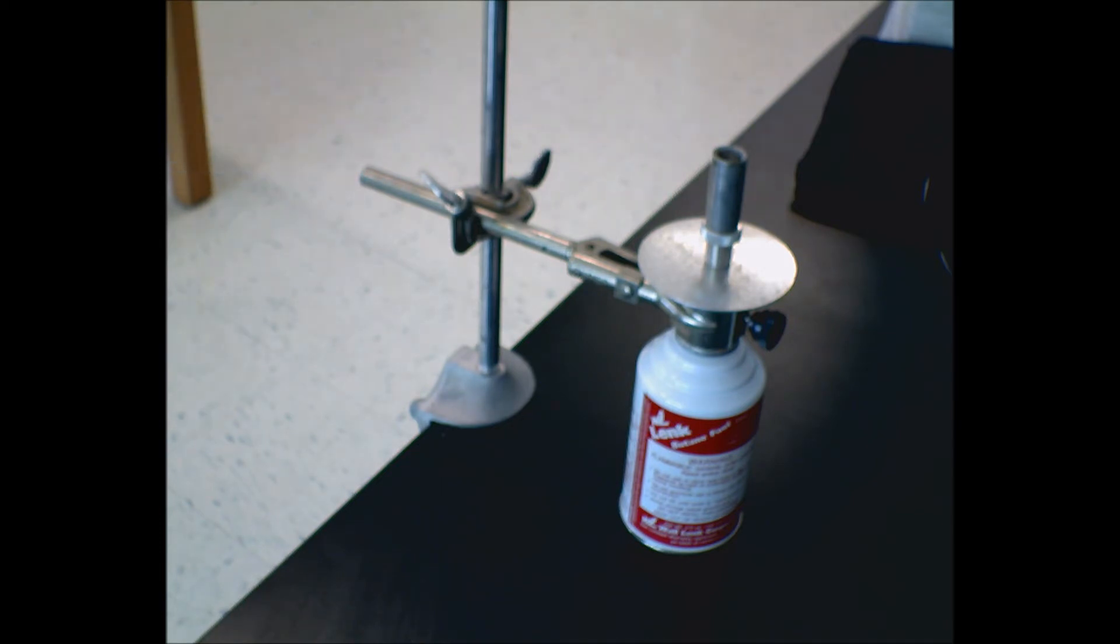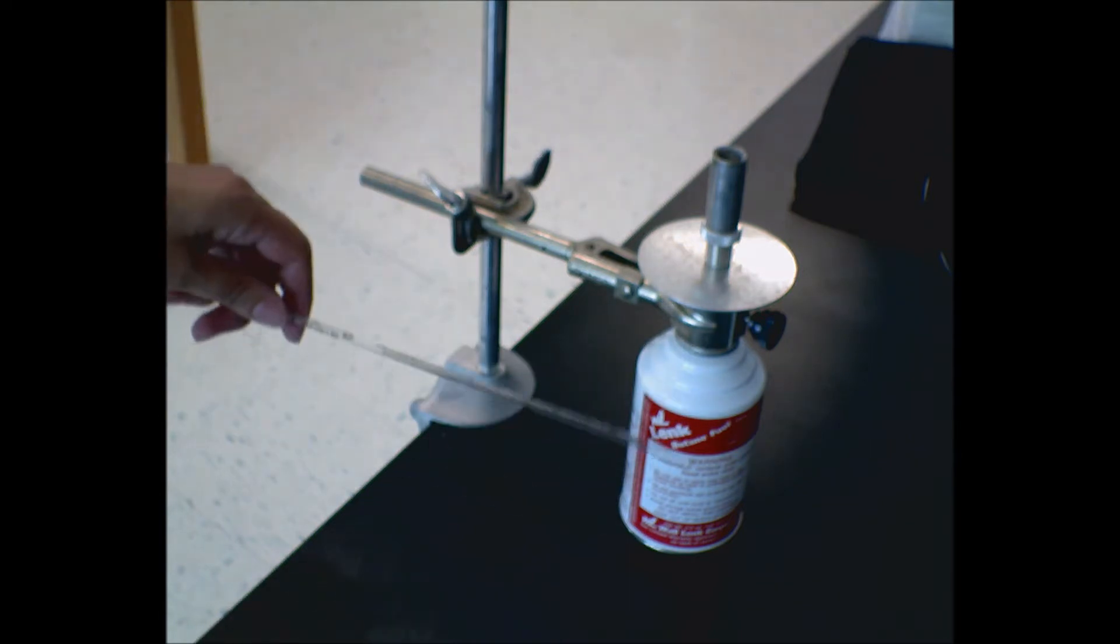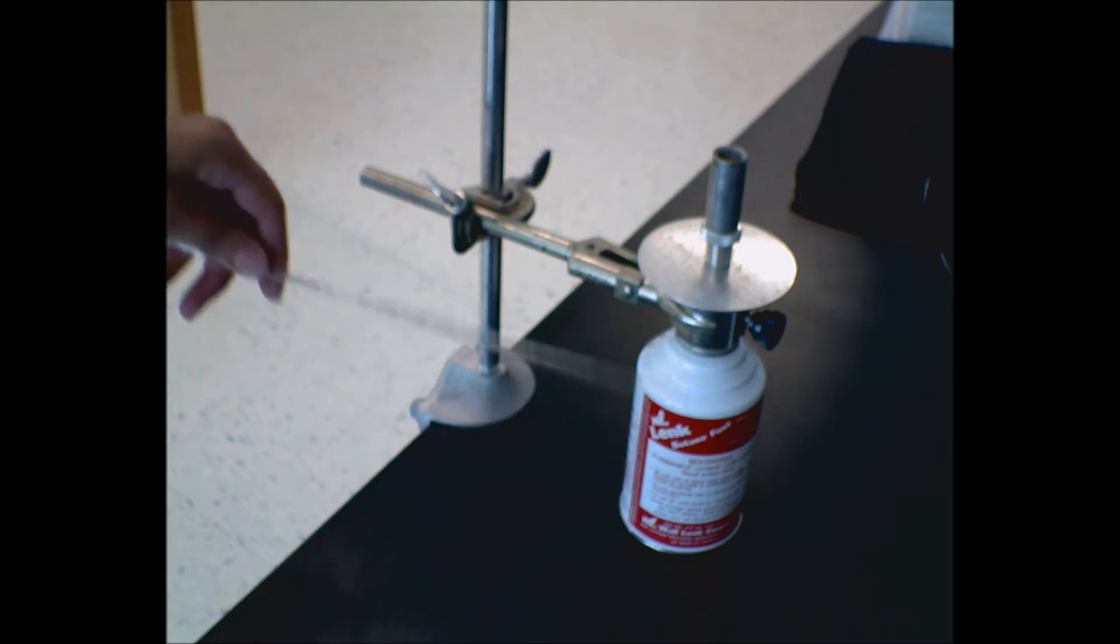So every time we do something with flame, this container itself will be directly attached with the clamp here. It will be attached at the top, or if you have the really wide clamps you can actually grab onto the can, and then it will be clamped to the table so it can't be rolling around.